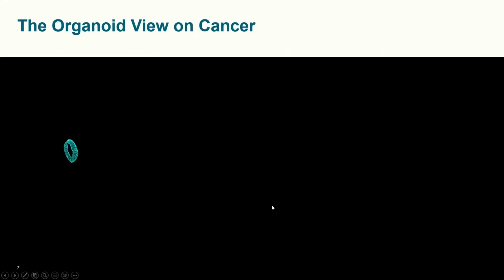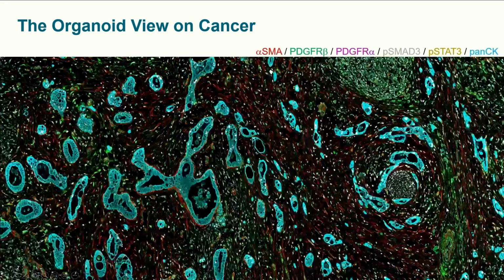The organoid view on cancer is of course still very limited. Here is how an organoid looks when we culture it: a nice monolayer of epithelial-like cancer cells. But if you look at the whole tumor, these cancer cells are only a very small fraction of the total tumor volume. This is a nice example of pancreatic cancer, which is notoriously well known for its large stromal contribution, the big stromal compartment.